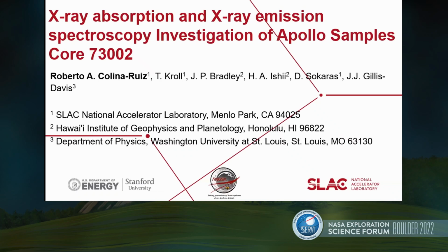This is Roberto Colina. I'm a postdoctoral scholar at Stanford University, working in the Stanford Synchrotron Radiation Light Source at the SLAC National Accelerator Laboratory. My talk is related to X-ray absorption and X-ray emission spectroscopy studies on the Apollo samples, core 73002, I mean the upper part of this double drive tube.